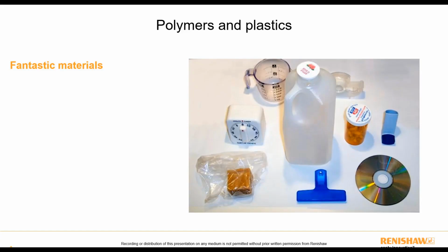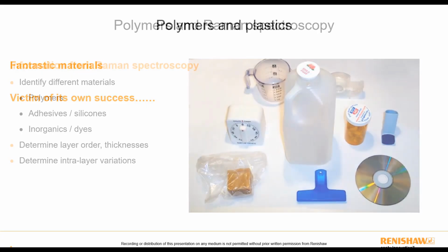Polymers are fantastic materials. They've got fantastic properties. And what we really want to focus on in this webinar is how we can use the different analytical techniques we've got, including Raman spectroscopy, to be able to produce better products, cheaper products, and products that are more environmentally friendly, so that we can keep using these, but in a more sustainable way as we go into the future. And to some extent, they've been so successful, it's primarily why we're in the position we're in, having to try to monitor some of the issues that the plastics themselves can cause for the environment.